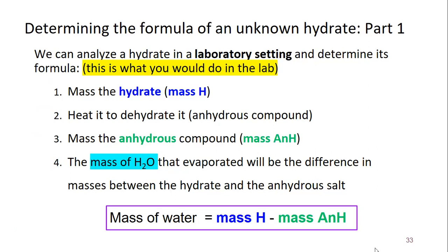So in this video, I'm going to teach you how to determine the formula of an unknown hydrate. Now, you were also supposed to have some practical experience with this in the lab, but since we can't do it, the next best thing is we're going to watch a video of the lab being done, and I'll explain what's happening in that lab as the work is being done.